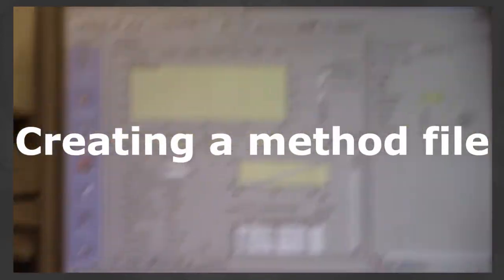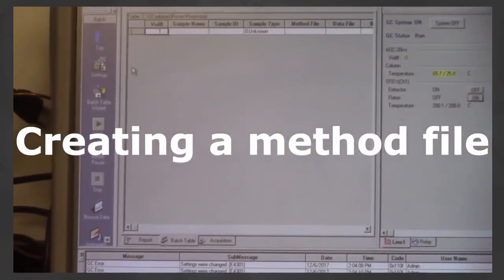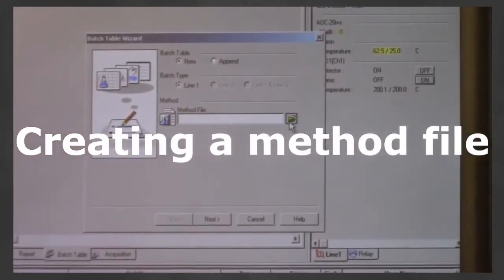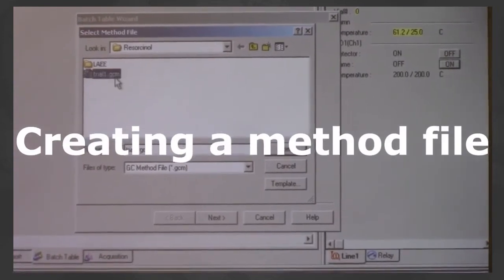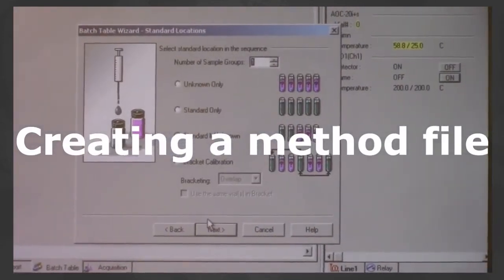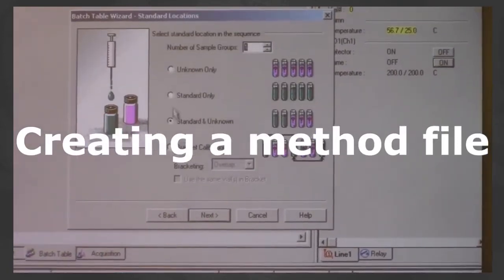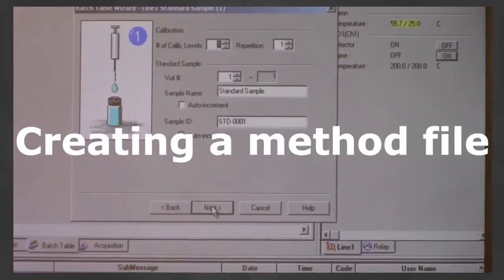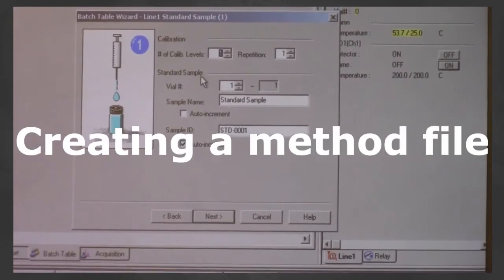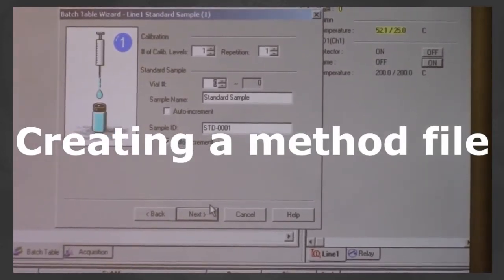Next, we're going to show you how to run a sample. So you go batch processing, batch table wizard, load method file. You select the method file you just created and saved. I didn't show you how to save it. Click next, standard unknown. We want standard only. Click next. We're going to go ahead and click under standard sample vial. It's going to be 0 because we're doing manual injection.